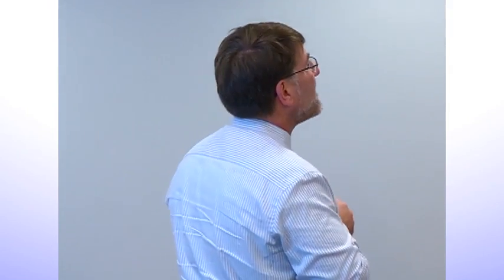In your example of raw data, I think you showed the reads are 152 bases long. Was that another technology? That was a MiSeq. We have several different machines in the sequencing lab. The GA2X gives us 36 base reads. The HiSeq gives 50 or 100s. I think it's going to go to 150s really soon now.